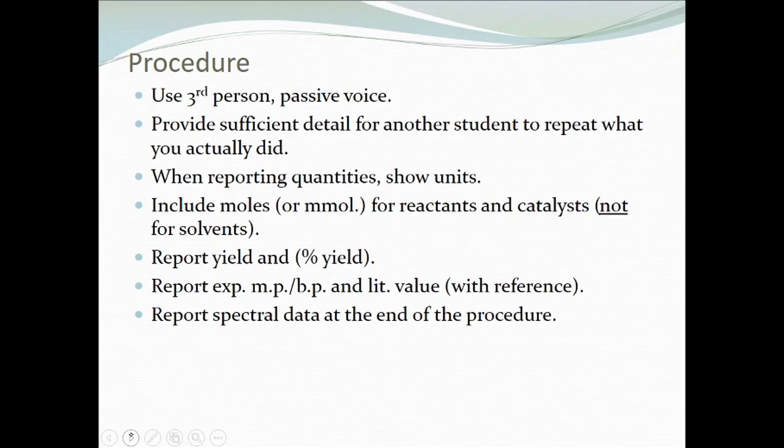Procedure, third person passive voice. You should all be familiar with this by now. Don't forget that you do need to show units, and especially, some people are still forgetting, you need to include moles or millimoles for all of your reactants and catalysts, but not for solvents. So water was a solvent in this reaction, you would simply give volume. On the other hand, the sulfuric acid is a catalyst.